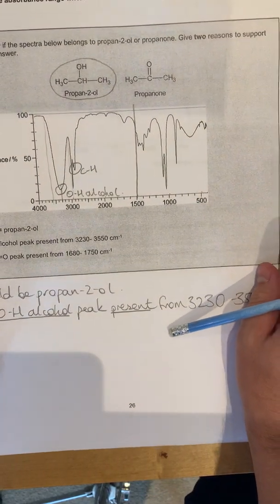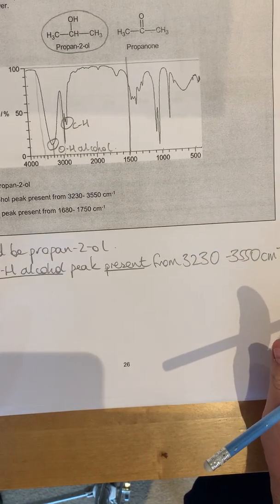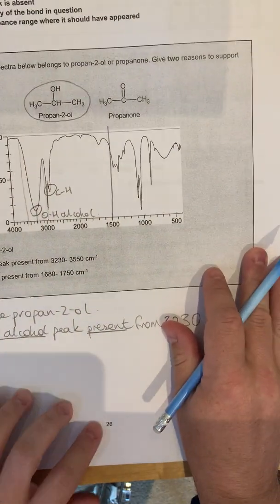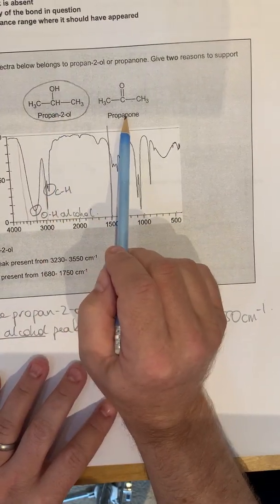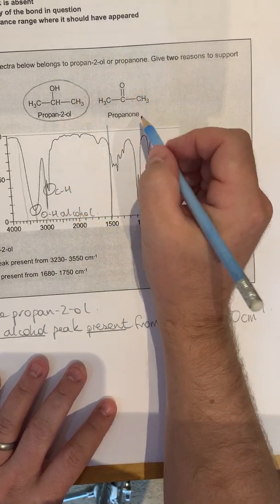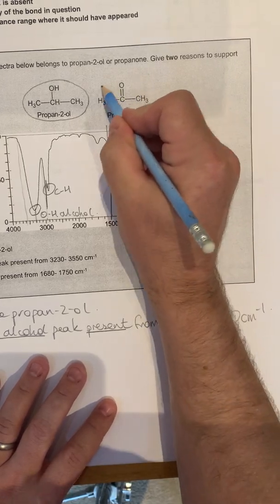Now you could also state what's not present. Now this question has set it up saying, is that peak either propan-2-ol or propanone? Well, we've confirmed that it could be propan-2-ol, but you may also, and quite frequently you do need to state this, you need to talk about why it's not that.